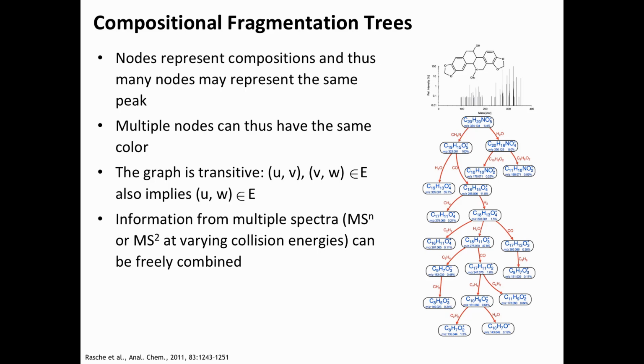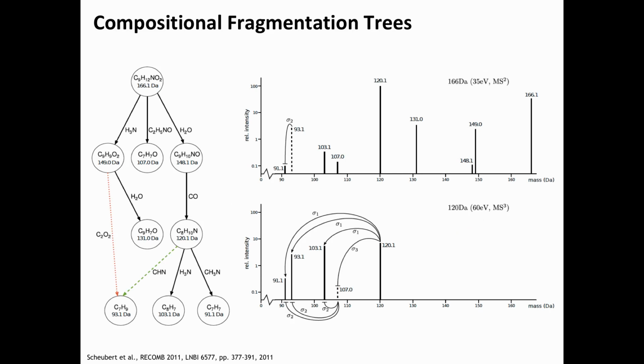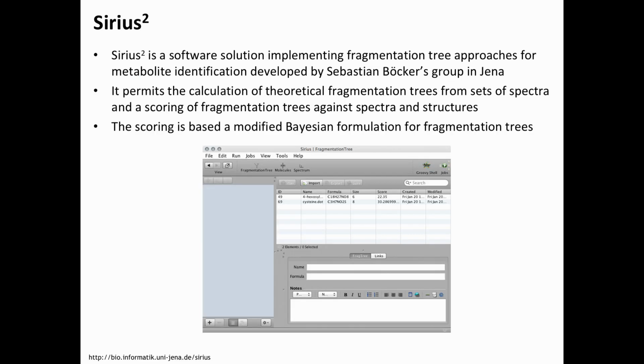It turns out that mapping that back to the fragments requires some thought. It turns out that you want to have some idea of which of these edges really occur. So there's lots of magic underneath, and you also want to have some idea of how likely certain things are. You can learn parts of this if you have a large enough database.